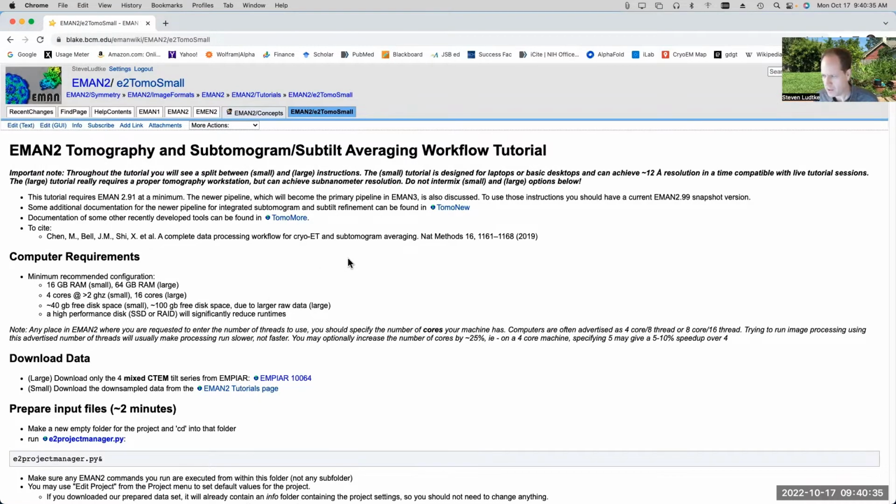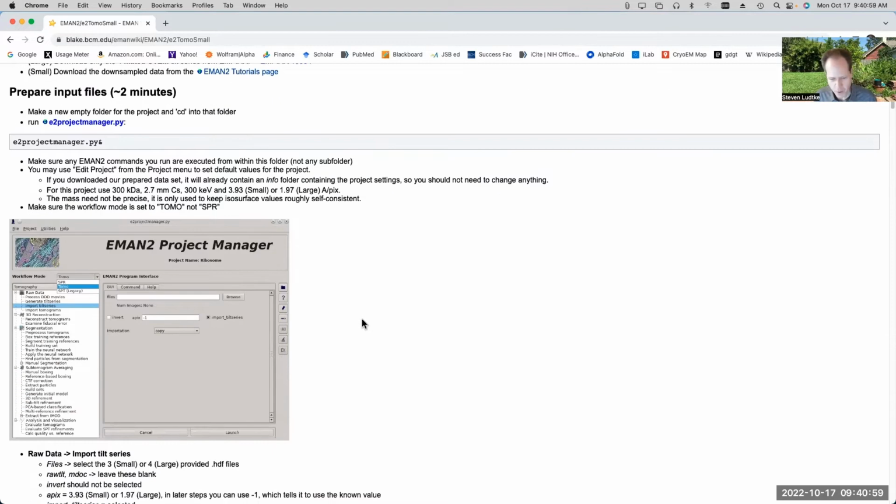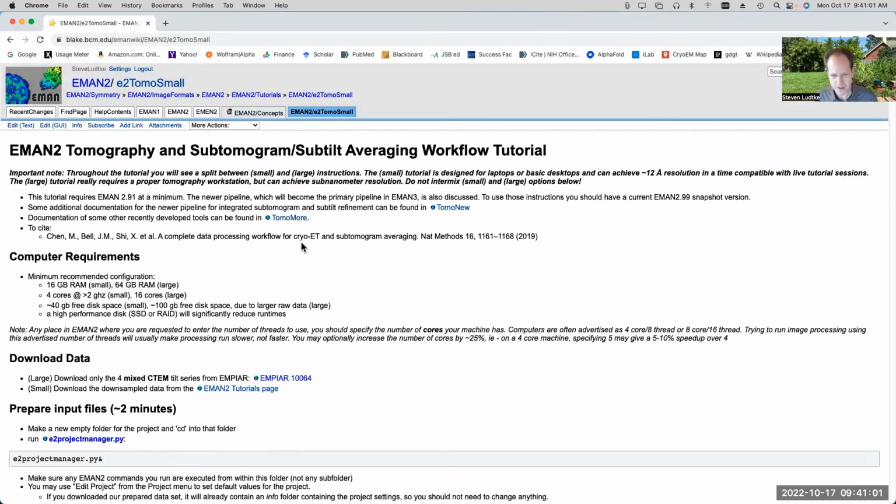Whether it's a good idea to do a lot of those modifications during the week when people are going through it or not, maybe not. I would say only make either trivial corrections or changes which are necessary to improve the clarity of what I'm asking you to do, like additions rather than removing or reorganizing anything during that time.